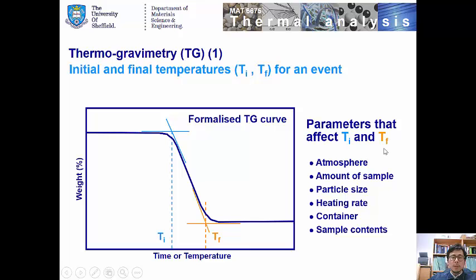These temperatures can be affected by several factors. There are a number of factors influencing these temperatures, so when you do measurements, you have to be aware of these things. Important ones are atmosphere. If the flowing gas and the gas generated during this event are the same or similar, then it has a significant impact on these temperatures.